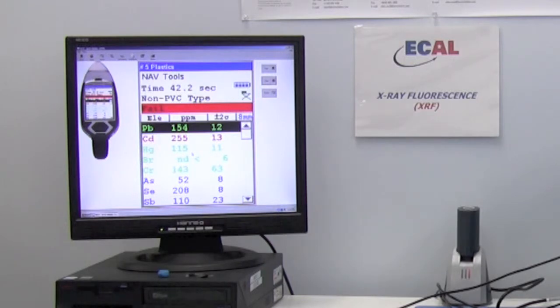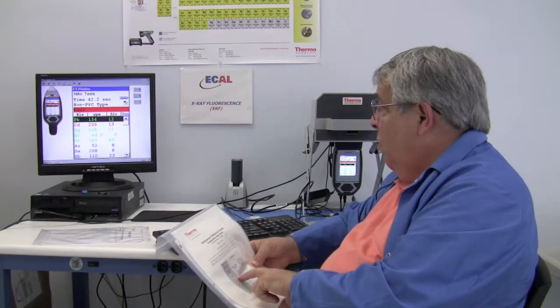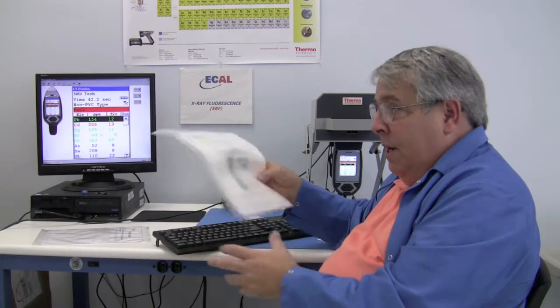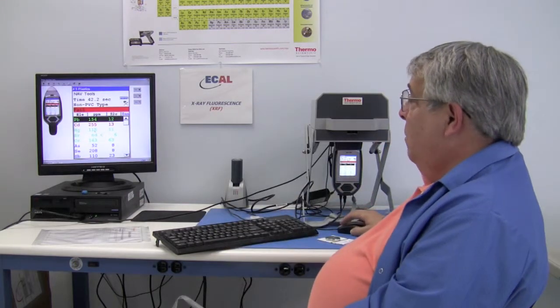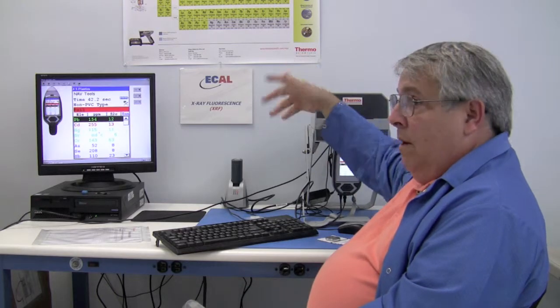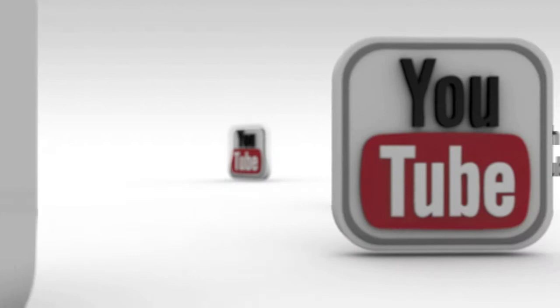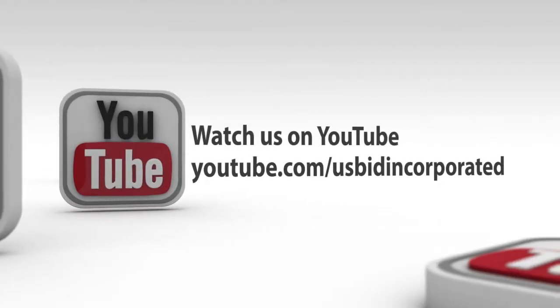Cadmium, we're a little off on. Chrome, 103 versus 143, plus or minus 63. Mercury, 106 plus or minus 10. So we're right in there. So what this is saying is that basically our machine is operating within compliance.